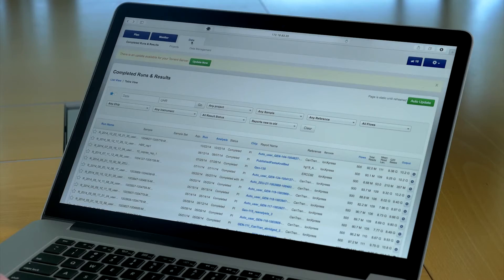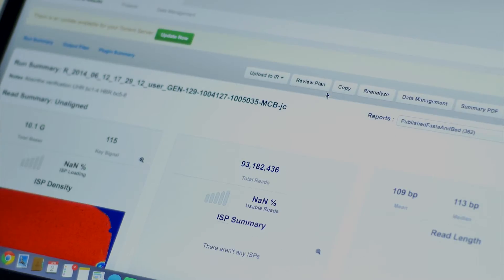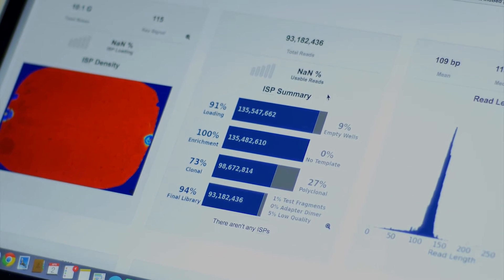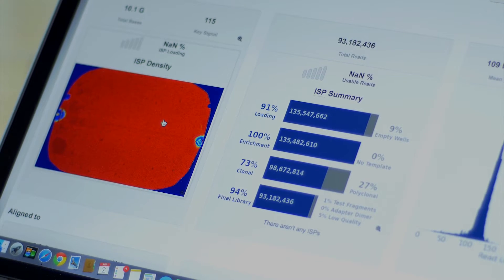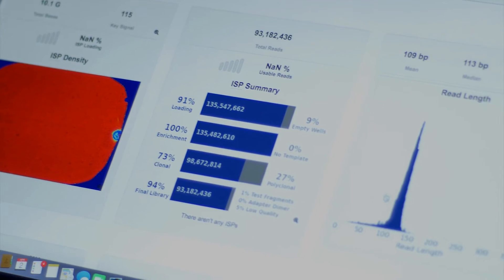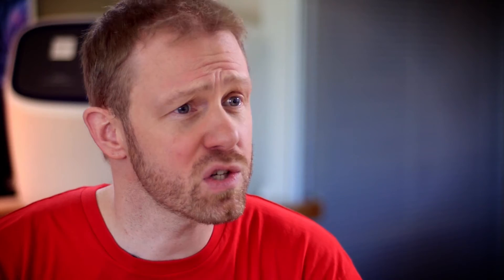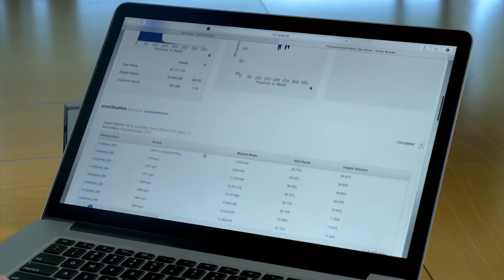From TorrentSuite software, you can access the run QC metrics by clicking the data tab and selecting your run. These metrics include loading density, which provides a similar image to the cell file from a microarray, the total number of reads, and the read length. You can also get additional QC plots for sample comparisons of log2rpm count data.